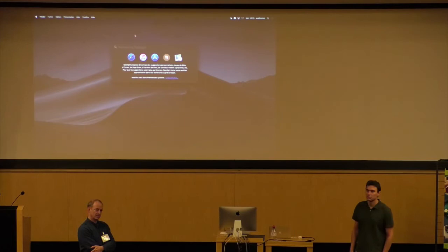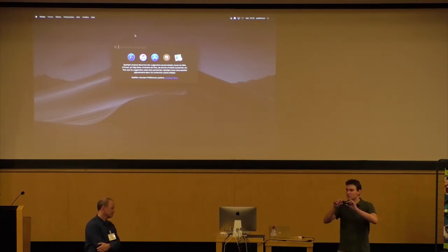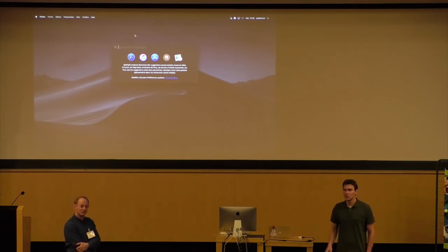How long does it take to write the whole grid from the beginning to the end? And how big is the usable area? It's a few seconds of writing, maybe 3-4 seconds, and then plunge freezing within, after filling, up to 360 milliseconds, you plunge freeze it. And then if you have a good grid, normally you have the droplet, and in the center part it's a bit too thick, and then there's a rim where it's good ice, and then a rim where the ice is too thin. And then I have maybe perfect 20 squares usable, which is enough if you have multi-shot on your Titan for one grid for a lot of data collection. And if you have a bad grid, then maybe only 3 or 4 grid squares have usable ice. But this needs to be tuned. So best is to have a screening day first when you try different conditions, and then you check. And if you have good conditions, it's reproducible.